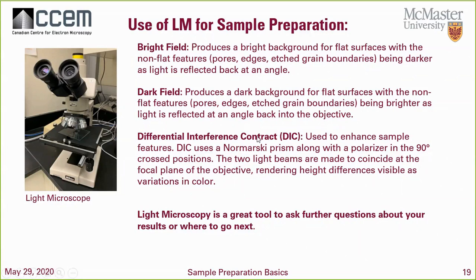And then one useful one that is extremely important that I use when I'm preparing EBSD samples, because you want to make sure that there are no scratches that are going to interfere with our signals, is DIC. And the way that DIC works is it uses a Nomarski prism along with a polarizer at 90 degrees crossed positions. The two light beams are made to coincide at the focal plane of the objective, rendering the height differences visible as variations in color.